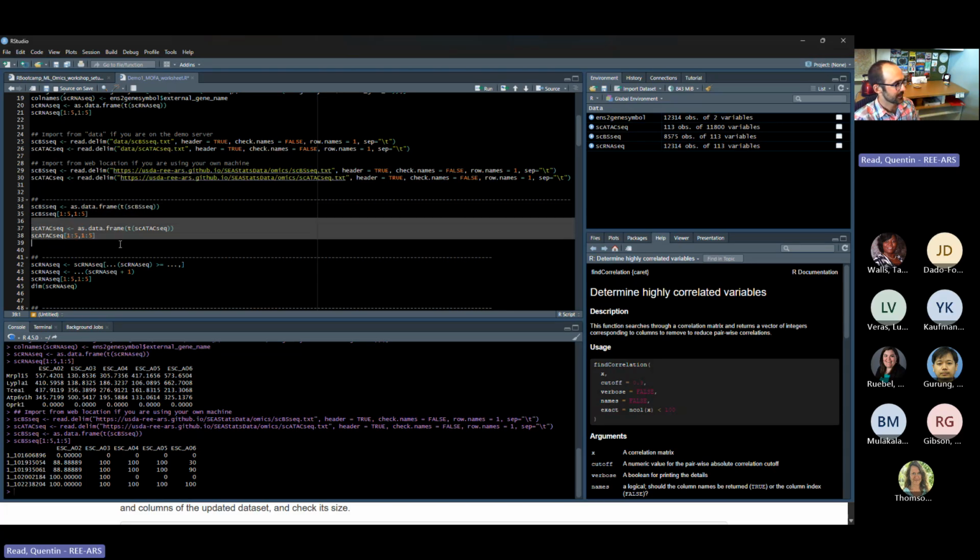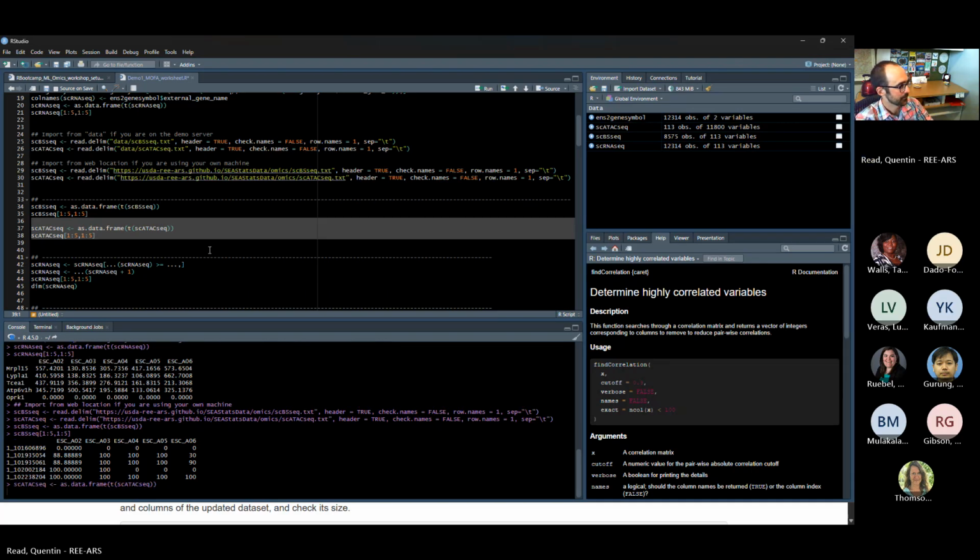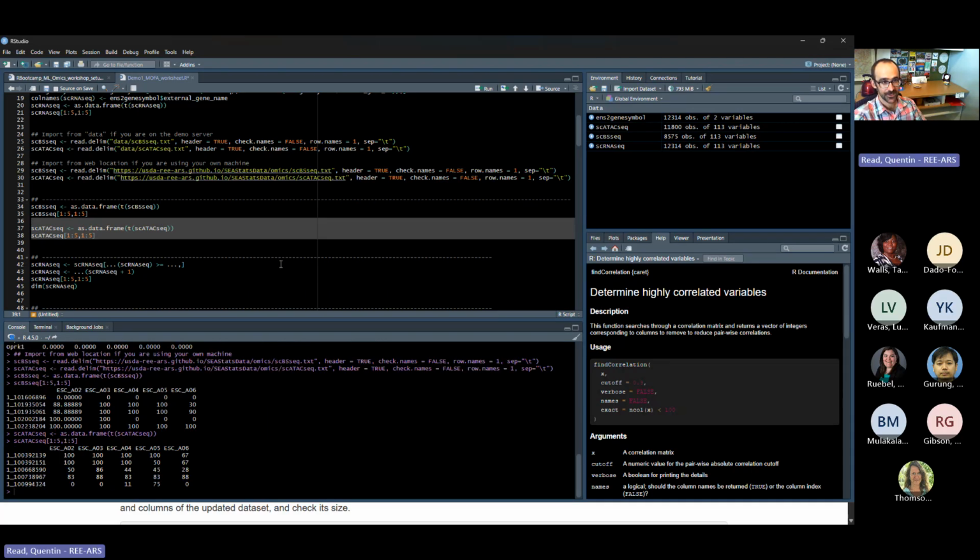And let's look at the chromatin accessibility as well by running the next two lines. That has the same format. Again, the column names are the same cells, but we also have values between 0 and 100, like 0 completely inaccessible, 100 completely accessible, and in between as well.